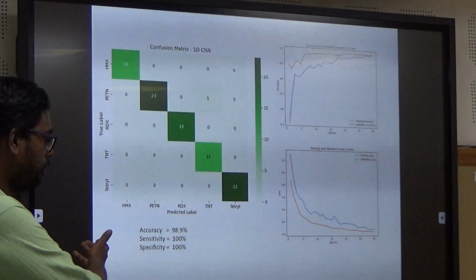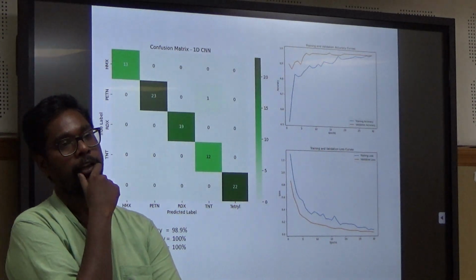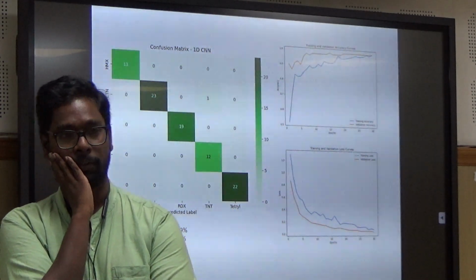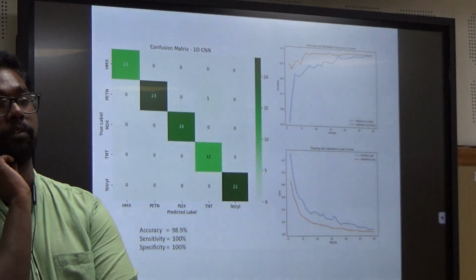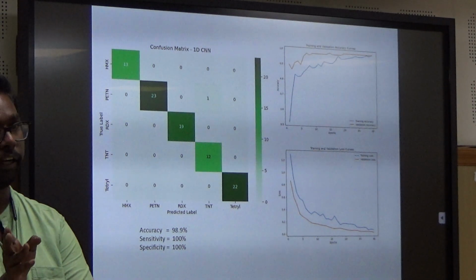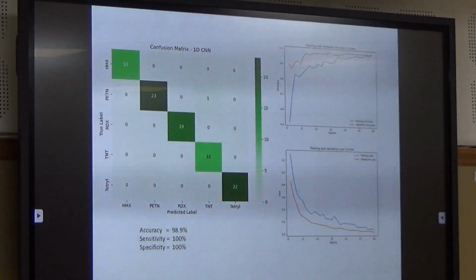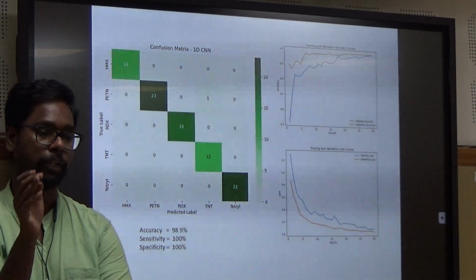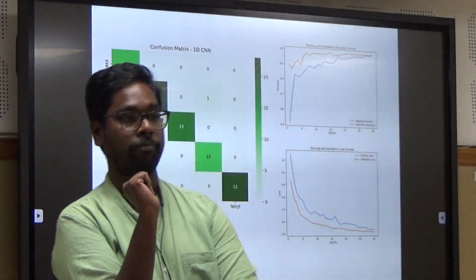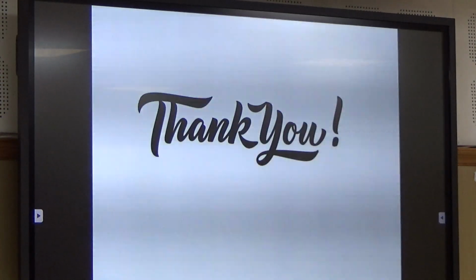So this is limited up to the spectroscopy part. We are simultaneously doing the imaging of the materials also. We want to use this same knowledge to classify images, just like CNN does in normal images. We generate terahertz images also. We want to apply this CNN algorithm to terahertz images and see whether the classification is performed correctly or not. So that's it. This is from our lab. Thank you.